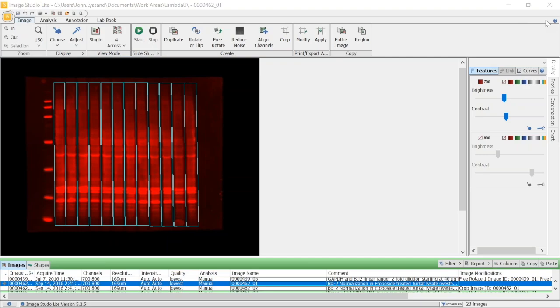Hello! Today in this section I'll be walking through how to properly normalize a protein of interest using REVERT Total Protein Stain from LICORbio. This type of normalization will normalize a target of interest against the total protein signal in that lane. This method is often a preferred normalization choice of publication journals over housekeeping proteins, unless you plan to perform a Western blot against a post-translational modification.